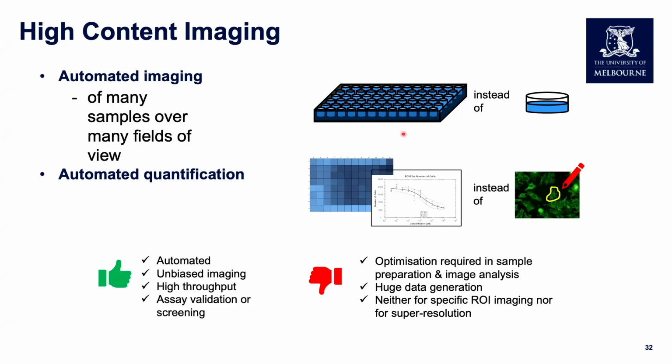You don't have to be manually going through and counting each of those. So we spend quite a bit of time with the researchers going through and optimizing their quantitative workflows so that at the end of the day, you get a heat map or an Excel spreadsheet or a graph of what your data is rather than having to manually go through and do the analysis yourself.